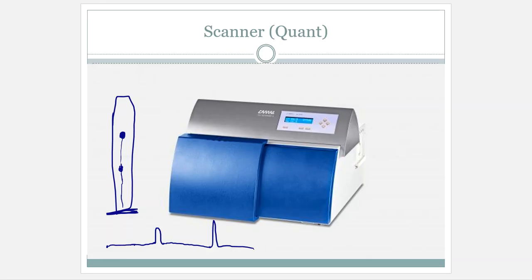Again, as before, when I make a calibration chart, after the instrument does what it needs to do, that's great. We are going to see an absorbance, and that absorbance is going to go onto the y-axis. And then on the x-axis will be our concentration. We know what standards we've made. We know what we've applied.